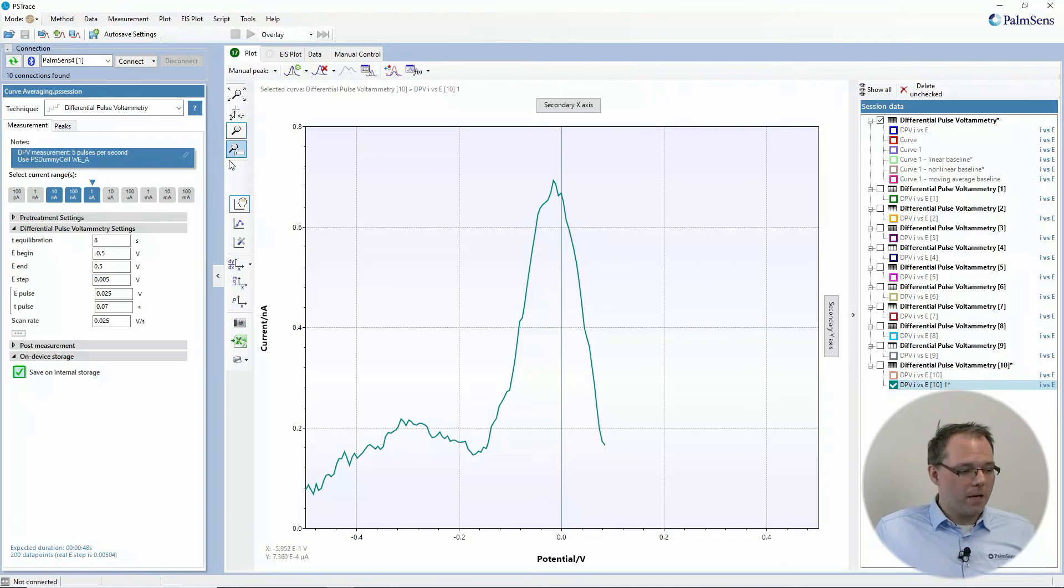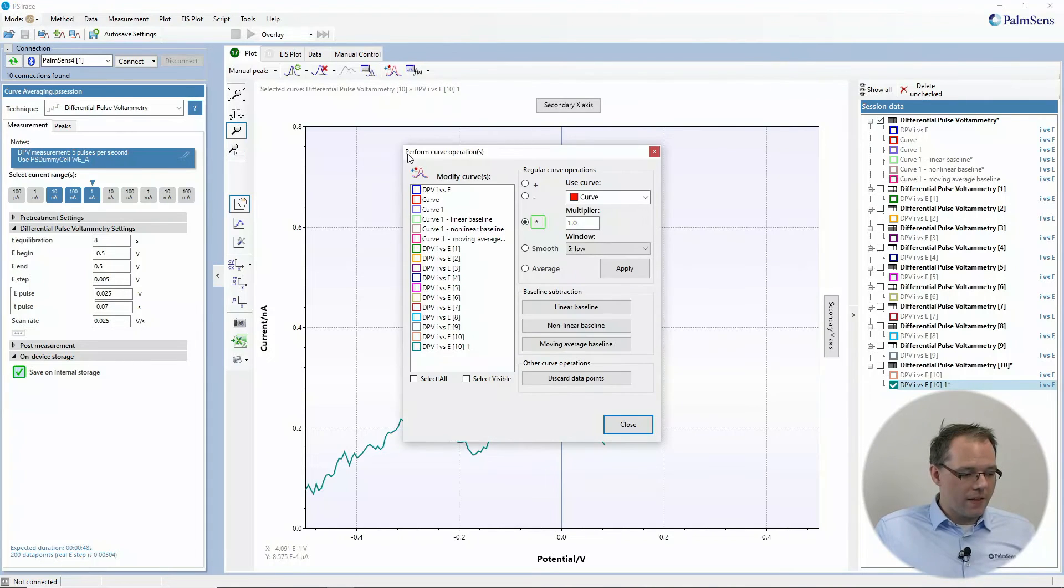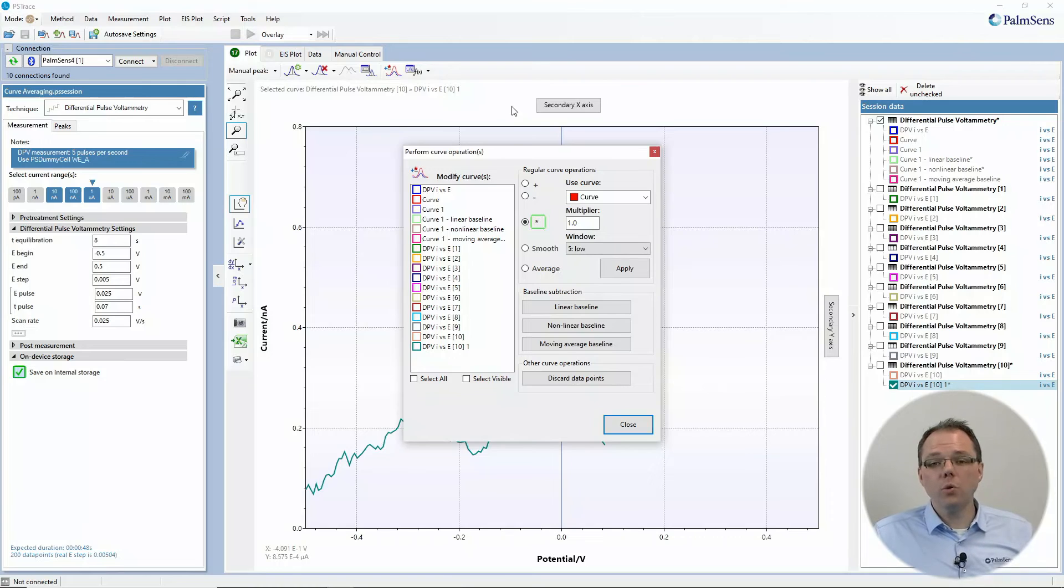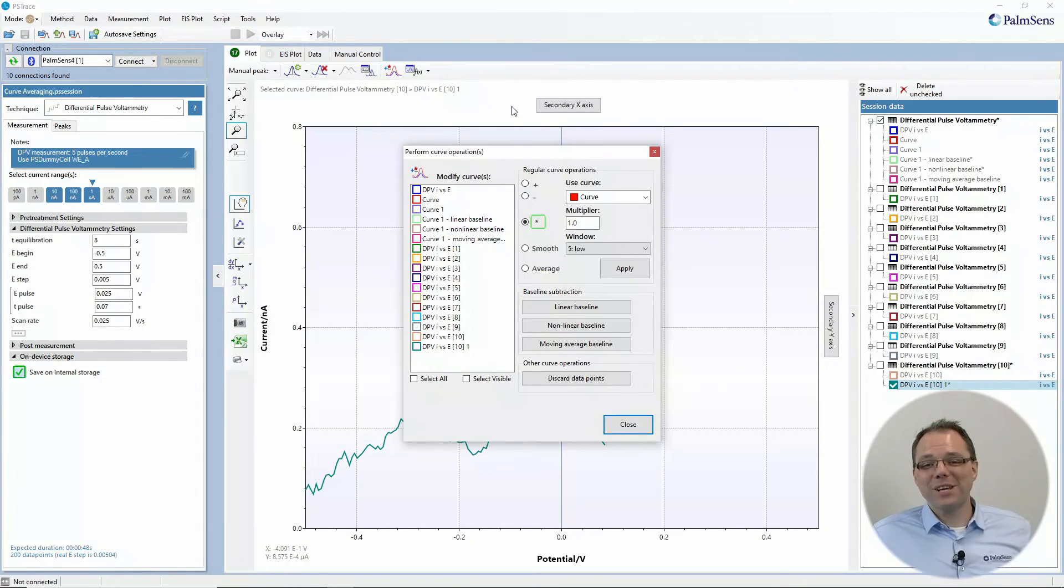Well, these are the different options that the curve operation window offers to you. I guess you can find a lot of applications for this. I'm curious to see what you are going to do with this. I hope you found this video helpful.